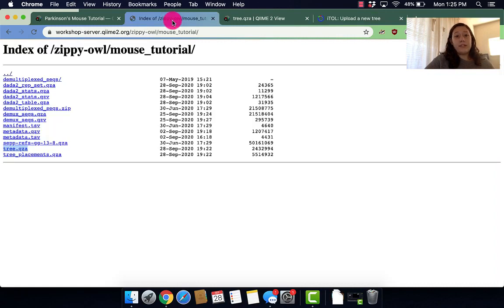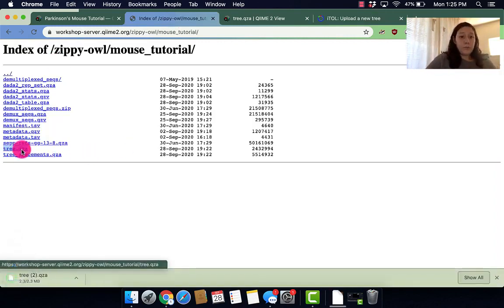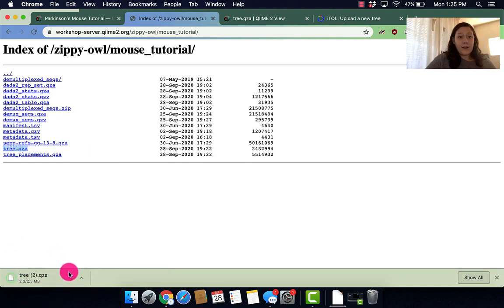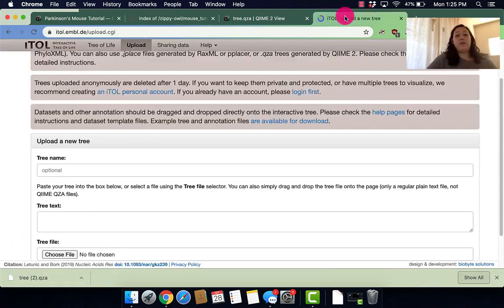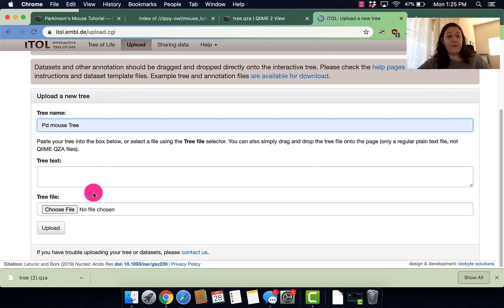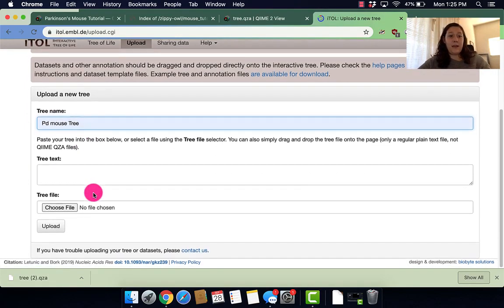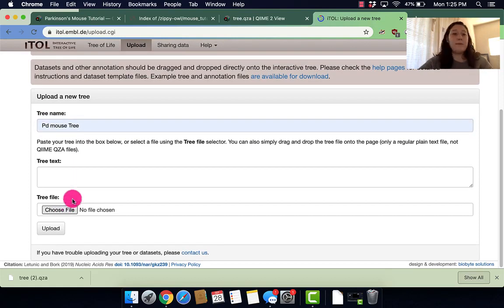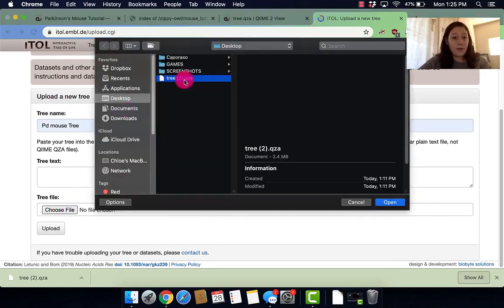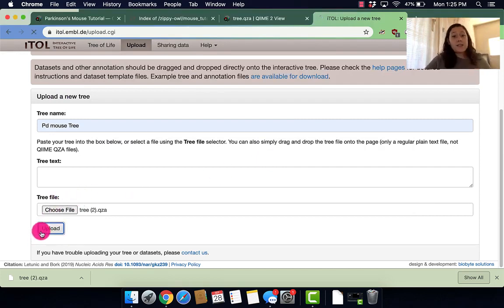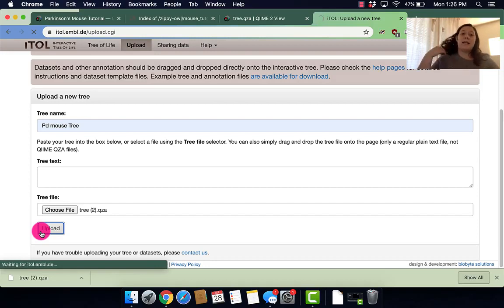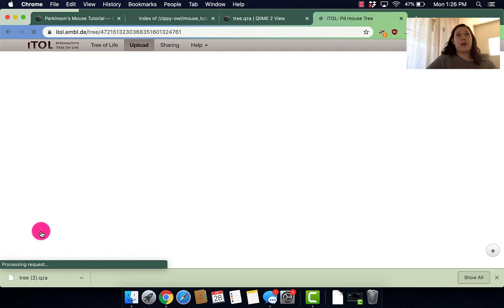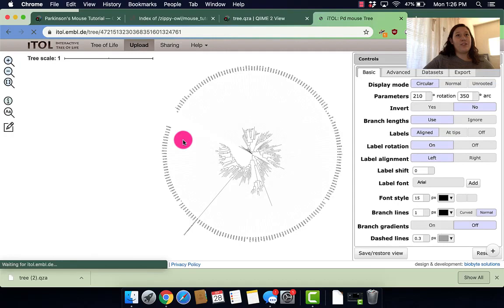So what we're going to need to do is head back over to that workshop server. We're needing to download that tree, tree.qza. And then we go back over to the tree of life website. We name our tree. I named it PD mouse tutorial. I'm going to choose a file from my desktop. Awesome! And now I'm going to upload this. It can take a couple of seconds to upload, but then we'll be able to see our tree of life that we created using QIIME fragment insertion set.